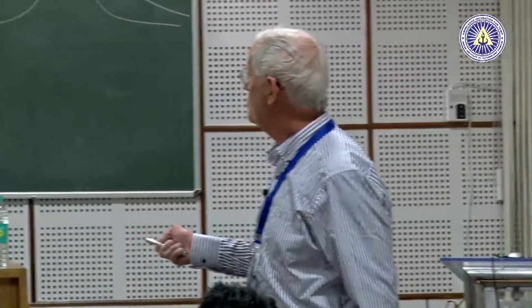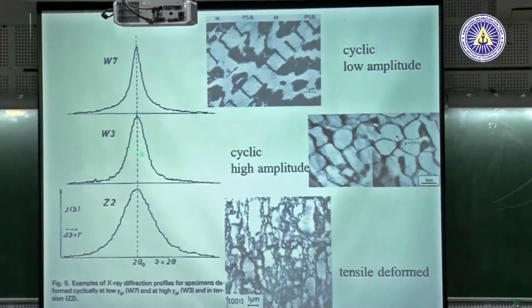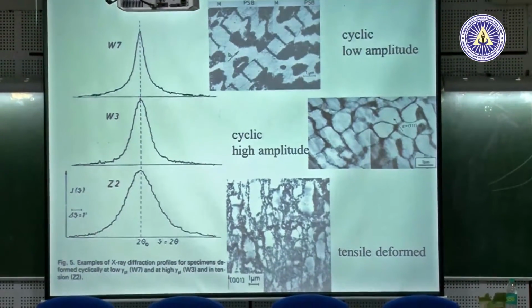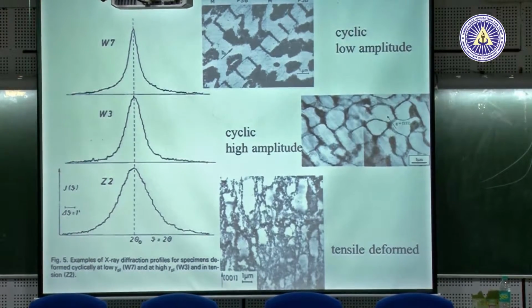Now, length of the tail should relate to where it's becoming zero, isn't it? Not exactly, because you see, it has to be normalized to the full width half max. Because we are only concerned about the shape, not the absolute values, only the shape.